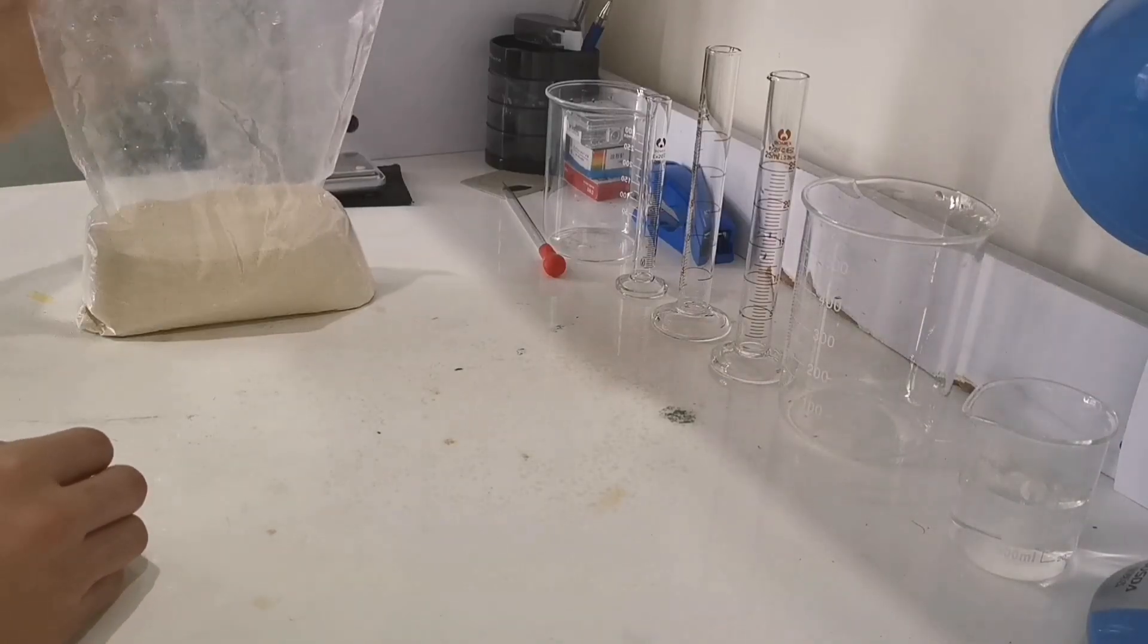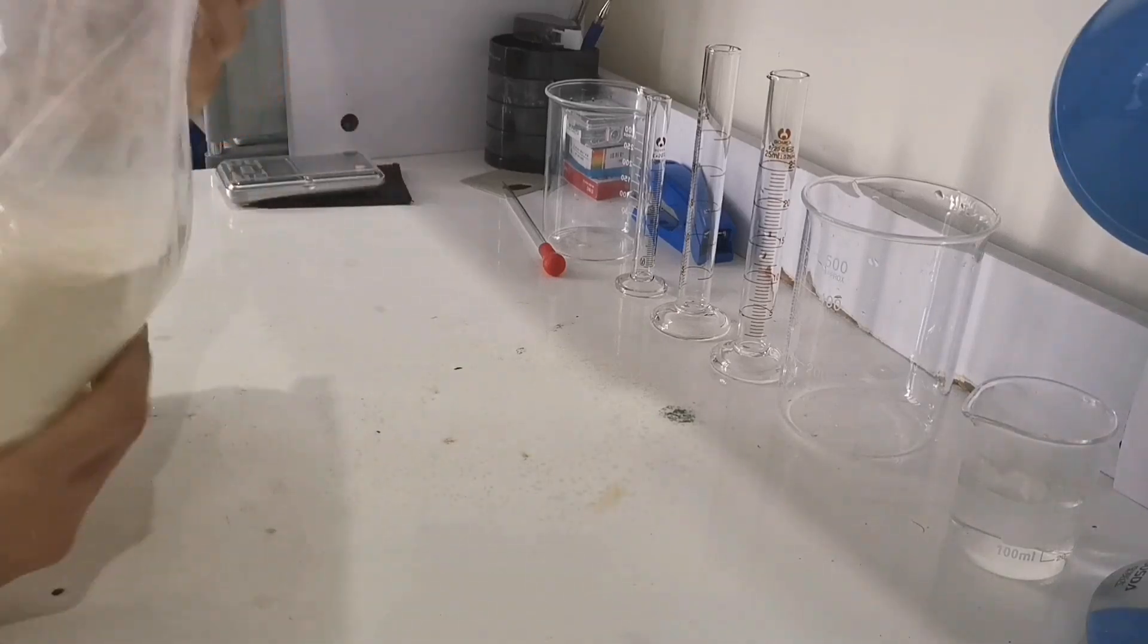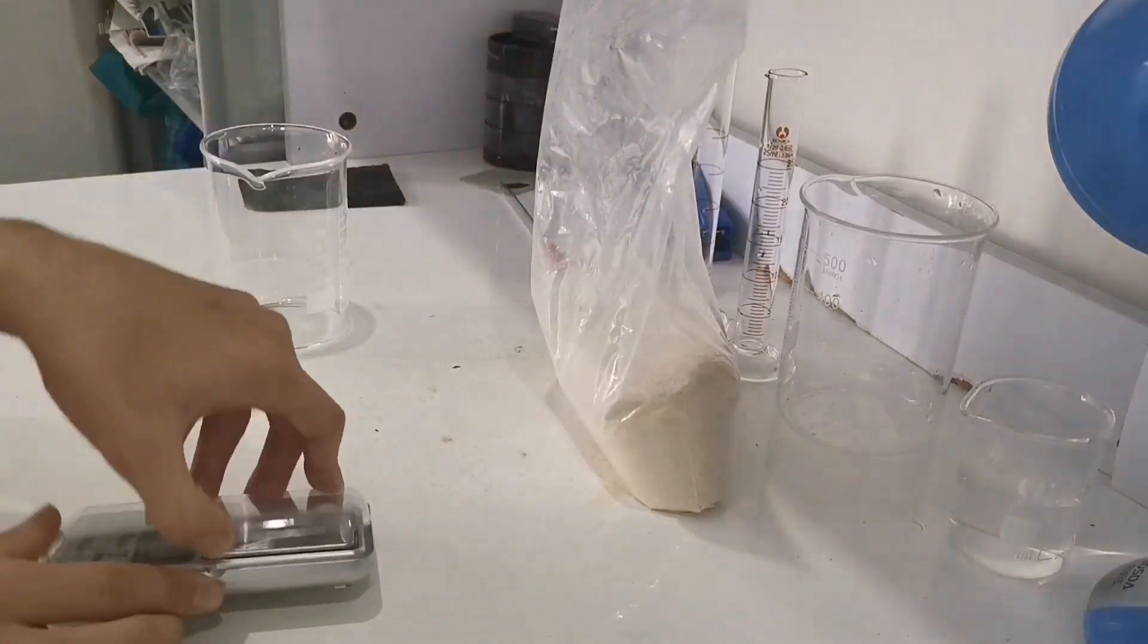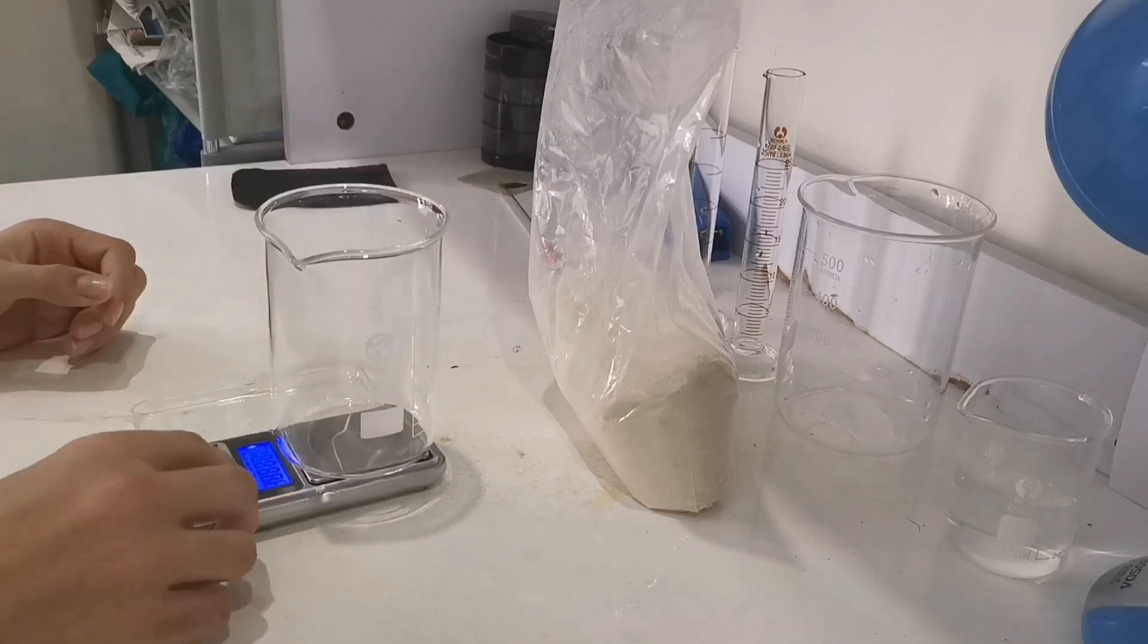So let's get started with casein. Casein has a whitish yellow color and it usually has a sheep wool flavor. Now we measure out 25 grams of casein into a beaker.